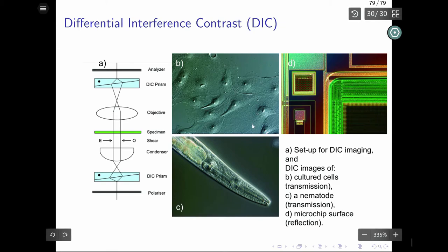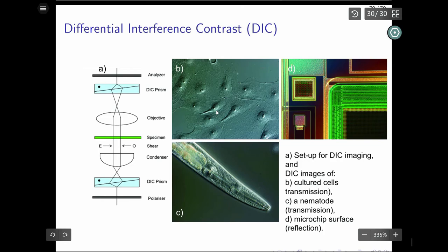The other technique, and you can look at that yourself, is differential interference contrast imaging. It's a very popular technique used also in conjunction with coherent confocal imaging. So here you just don't use fluorescence confocal, but you just use the confocal itself to look at the transmitted light of a laser beam. The principle is very simple. You take the laser and you split it slightly apart so that you actually get two parallel or two slightly angular beams that are diverging from one another just a little bit, right?